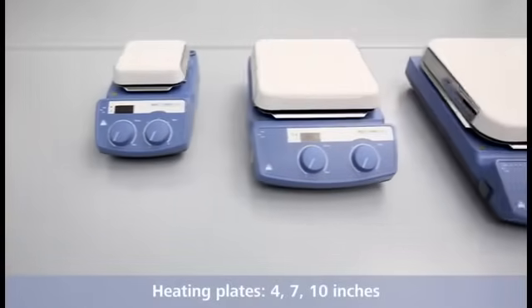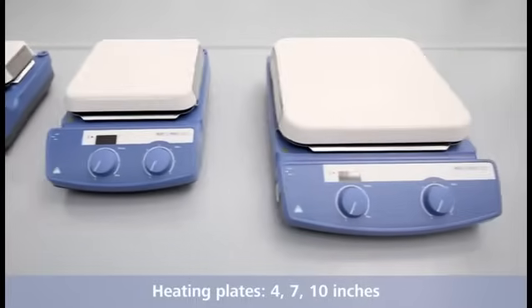All devices are available with heating plates of 4, 7 and 10 inches.